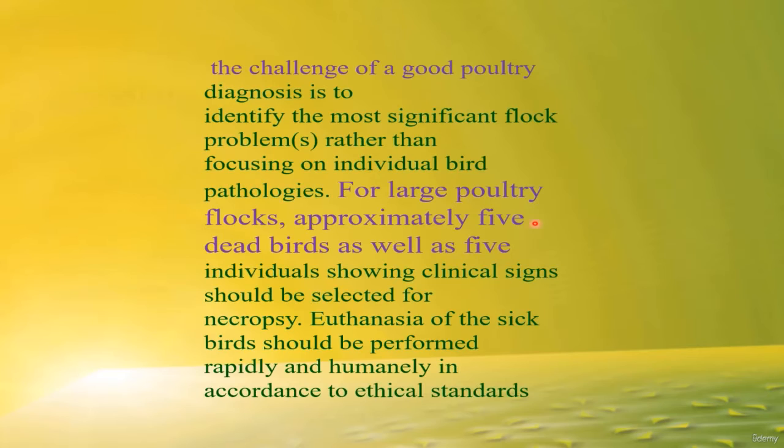action. The challenge of a good poultry diagnosis is to identify the most significant flock problems rather than focusing on individual bird pathologies. For large poultry flocks, approximately 5 dead birds as well as 5 individuals showing clinical signs should be selected for necropsy.